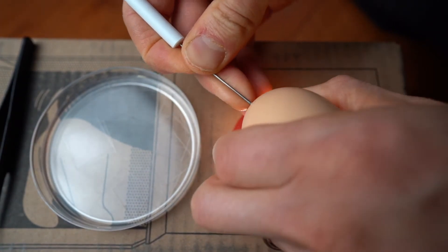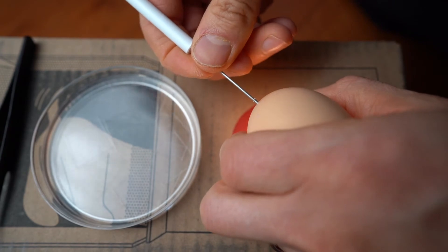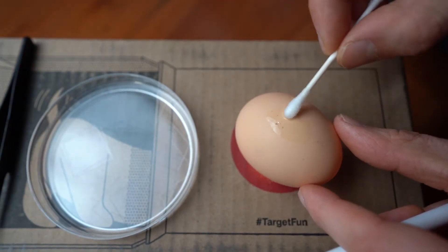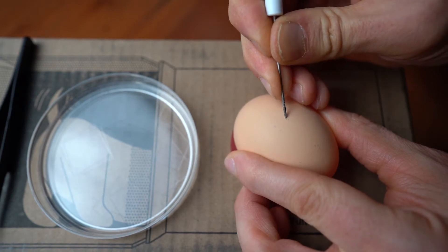You might want to candle it to find the exact spot, and I just poke in ever so slightly into the back end of that and it should allow for a bubble to pop up at the top of the egg here.